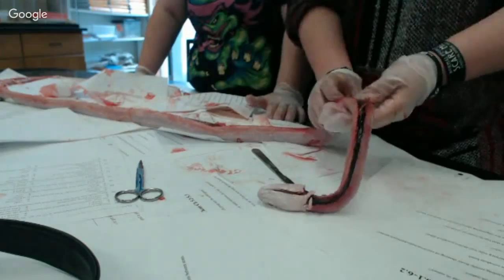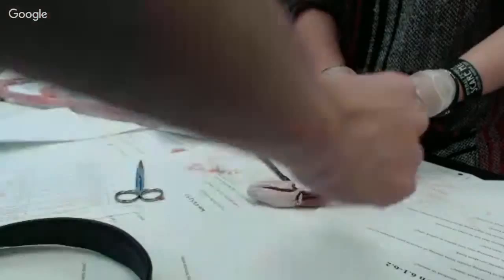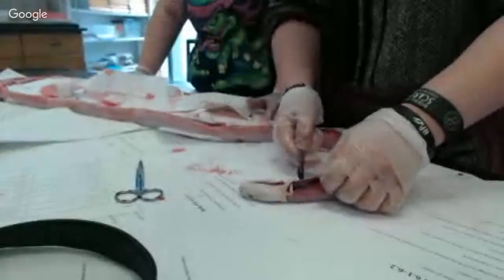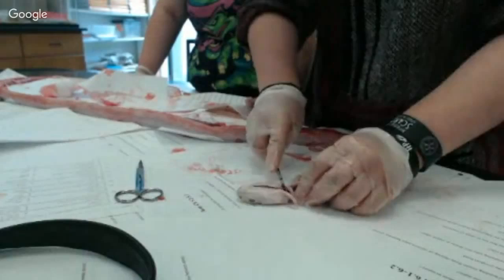How do you... here. I can help you out a lot. No, I'm just kidding. If you're trying to come up here, all I can see is the trachea. Yeah, if you come all the way up here and cut it out up top, you can grab it and you don't even have to cut that. You can just pull it all the way out, like right behind the throat. Cut it all out to the bottom, and then you can just grab it and pull it all out and fold it out.